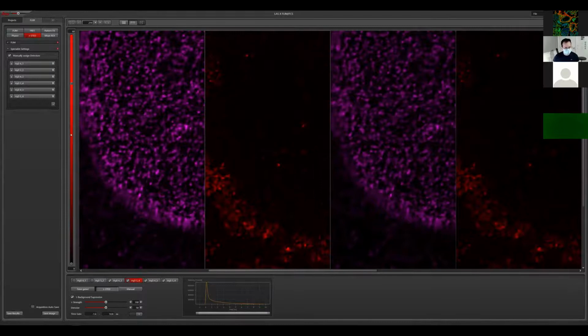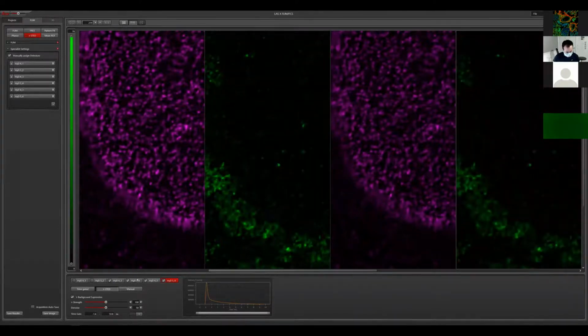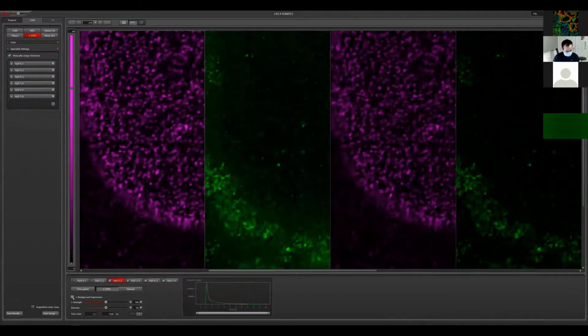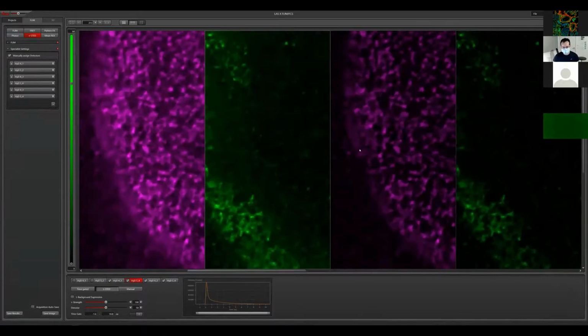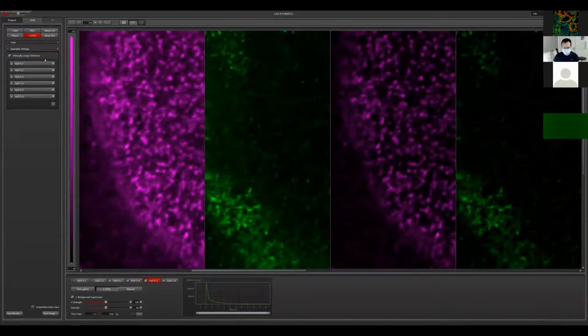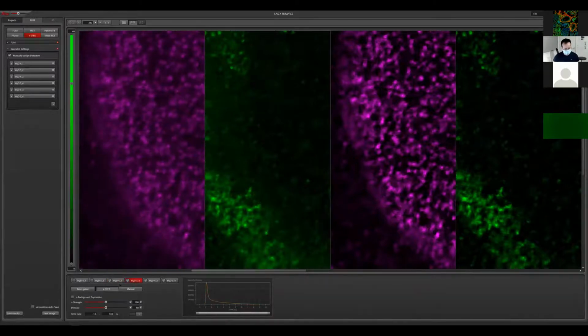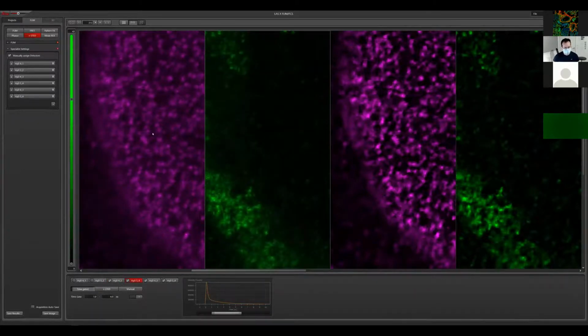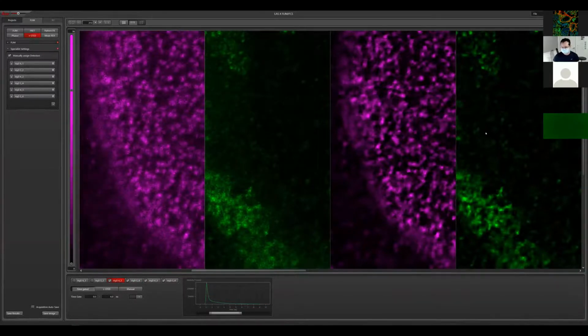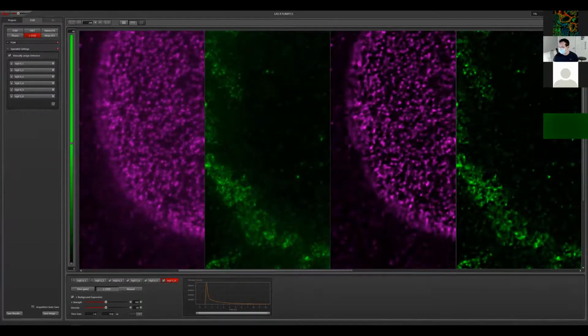Again, I don't have my eyes on the chat, so if someone has questions about what I'm doing, it's not that complicated, I'd say. For example, here you have a direct contrast between these two colors, Tau-STED and, let's say, normal confocal. And I can even now apply the time-gated here just to see what is equivalent. And you see the performance and resolution, how nice it is.